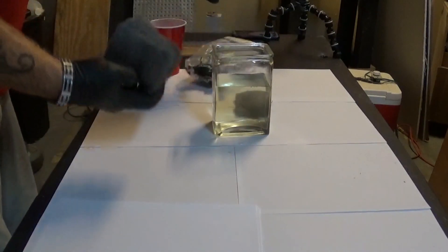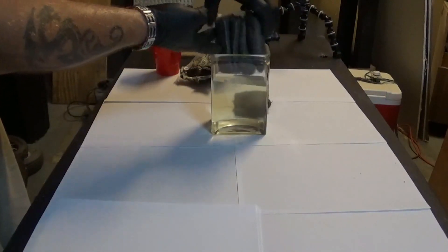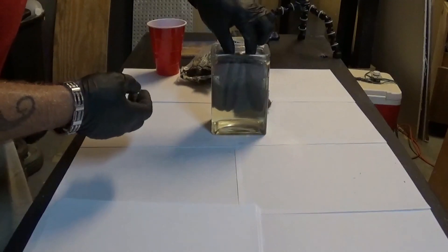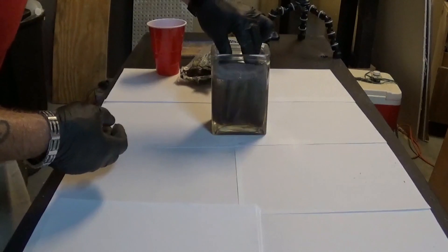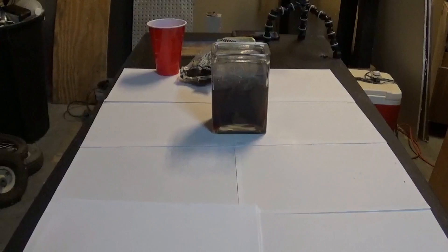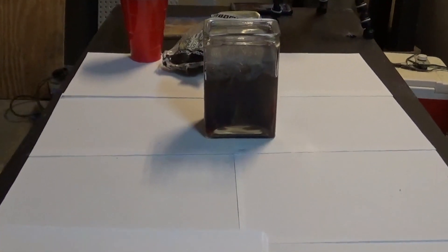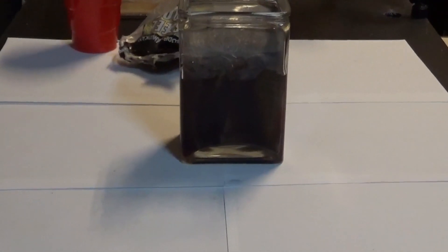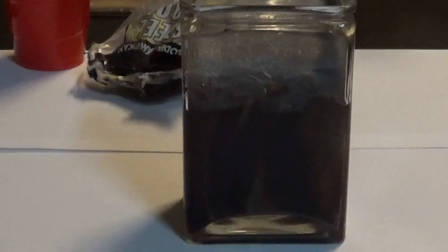Now I take these steel wool pads — there are about four of them — and put them into the square jar. Almost immediately it starts turning color. Look at that, it's already turning color, and give it a few minutes, it's gonna be pretty warm.